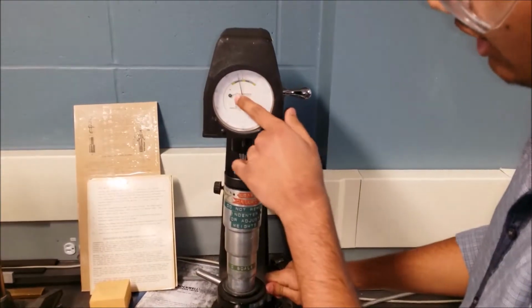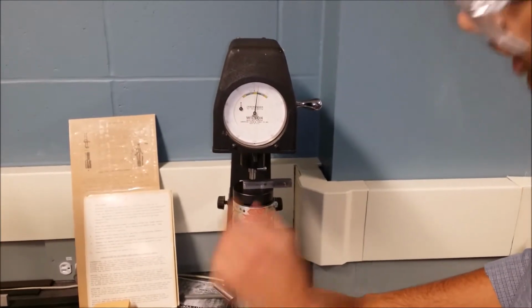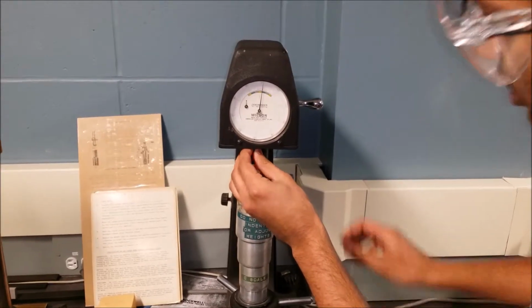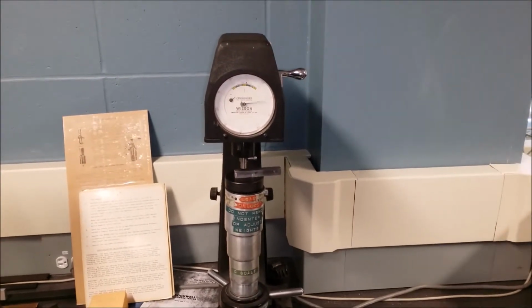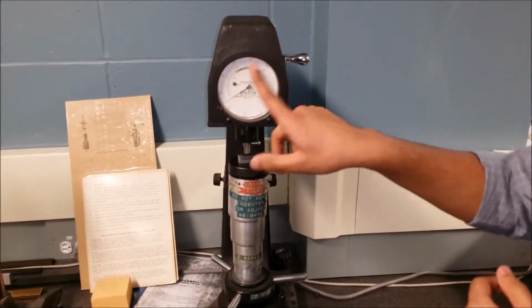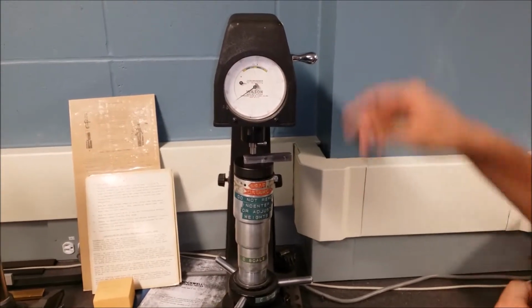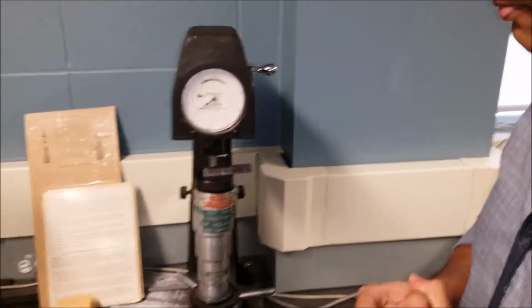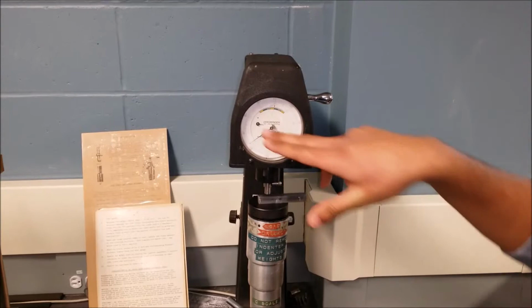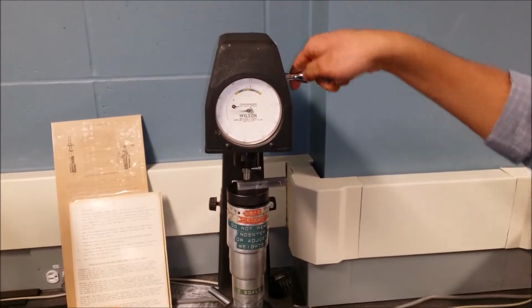Then we check, and we have to make sure this is at the black dot right here, and it has to be +5 or -5. It's all good. And we have to make sure that this is 0. We have to set it to 0 so we can go. We look at how many times it goes around zero, and if it's more than 1 and then comes back, it has to be 0. Then we have to wait until the needle stops right there, and we just pull it back to get the result.